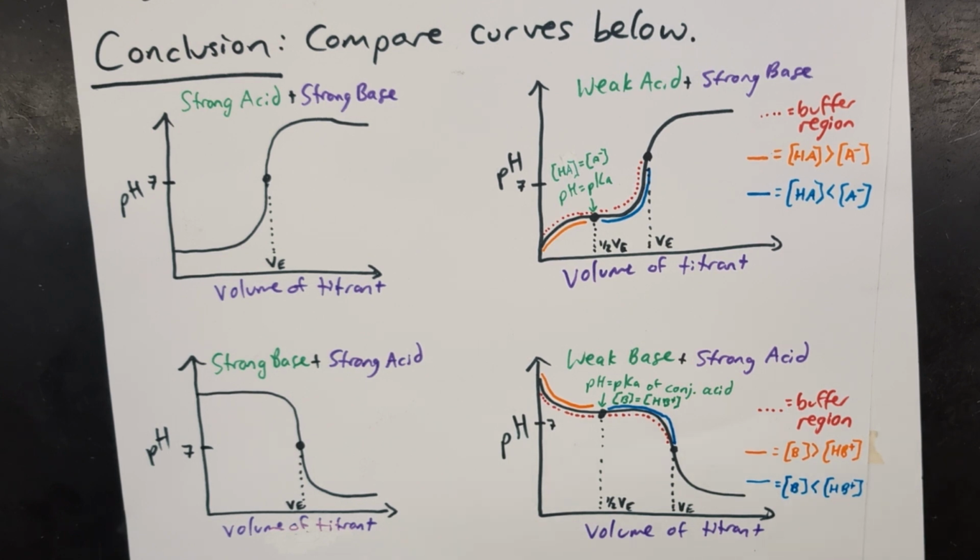So these are the things you want them to get out of while they're working. I will give them some hints before I let the students rotate around and see, like, oh, hey, you're missing the concentrations before half equivalence point. I'm like, oh yeah, and I'll add that in. So that's kind of everything that they need to know.